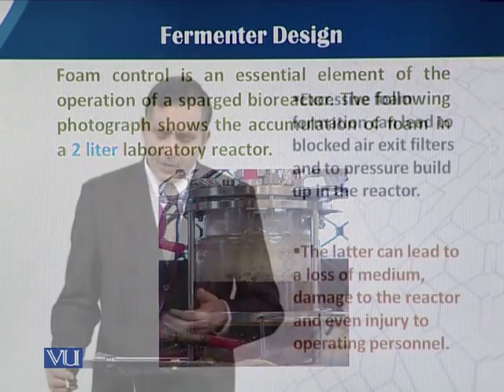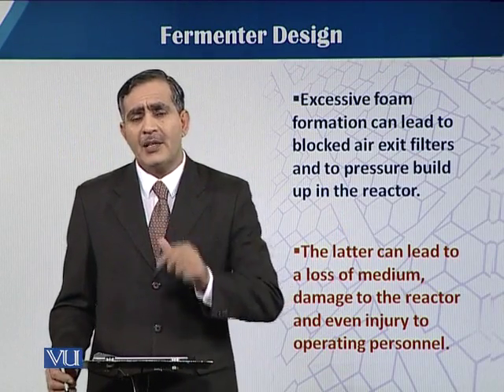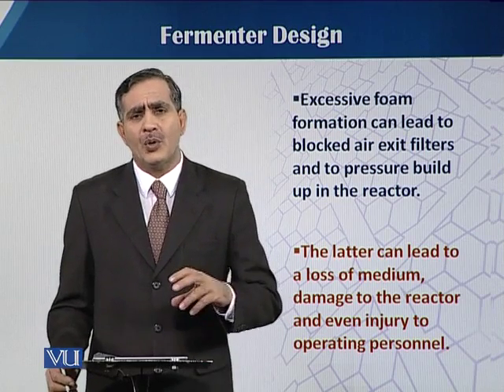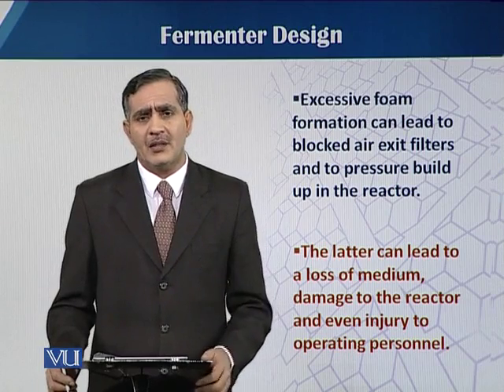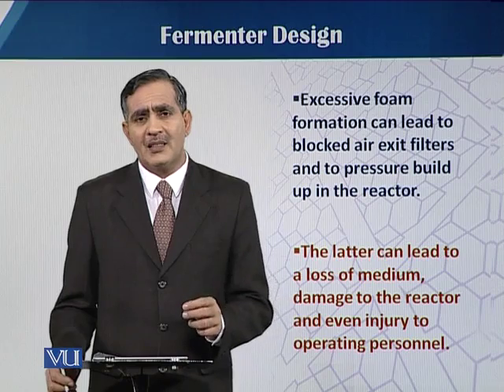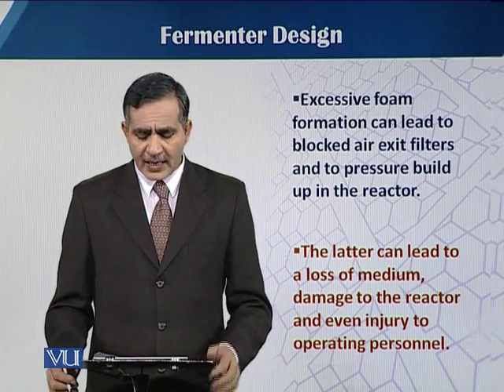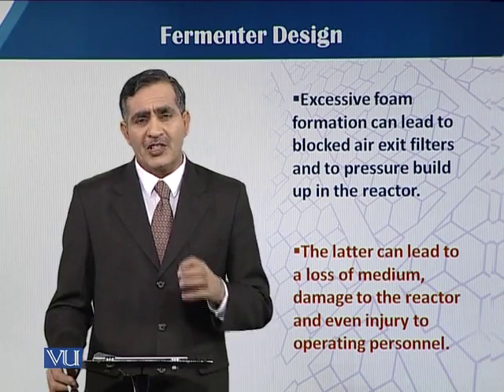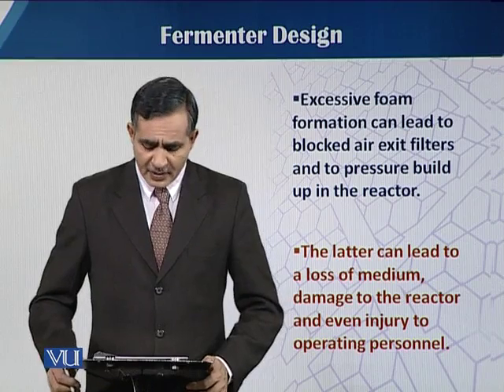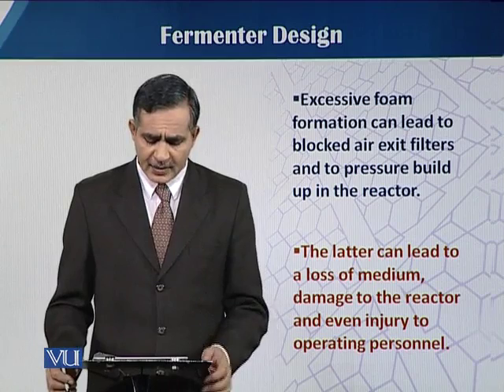So excessive foam formation, when it tends to go out through the exit point, can choke the air sterilization system, which we call the filter. In such a case there is a disturbance, which can cause pressure build-up inside. So there are many things that can happen.